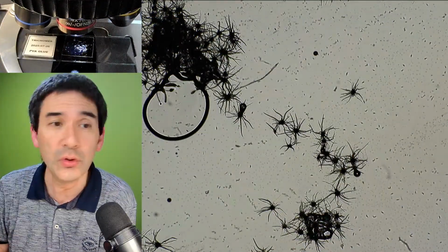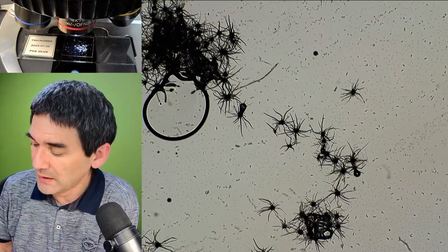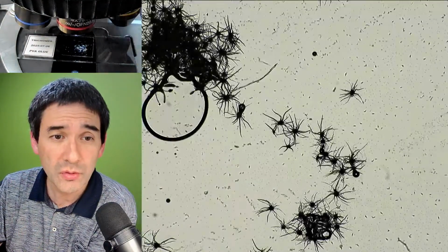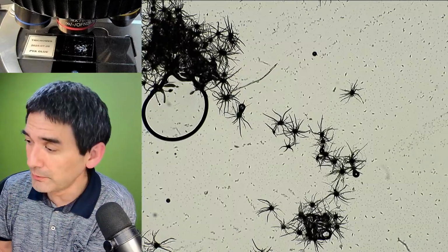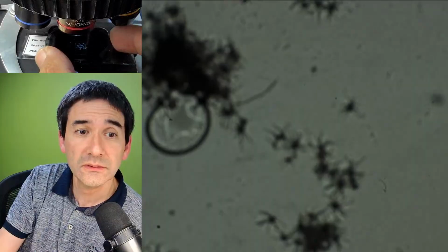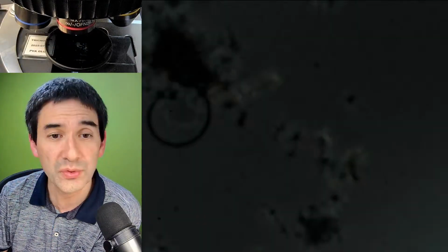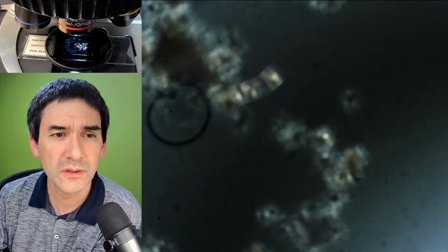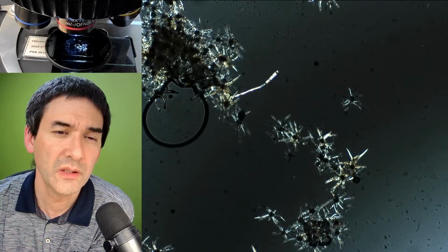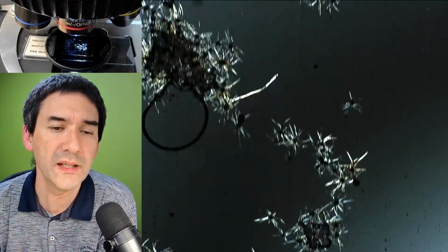And what I'm going to do now is place a polarization filter, removing the other one over here, on the bottom, and I'm going to place also one on the top. And of course, know that I'm going to be touching the cover glass now. And let's see if these are somehow polarizing or not, but they don't seem to be. Maybe they are. Okay. Let's see if they're... Yep. Okay. So this is now basically in cross-polarized light.